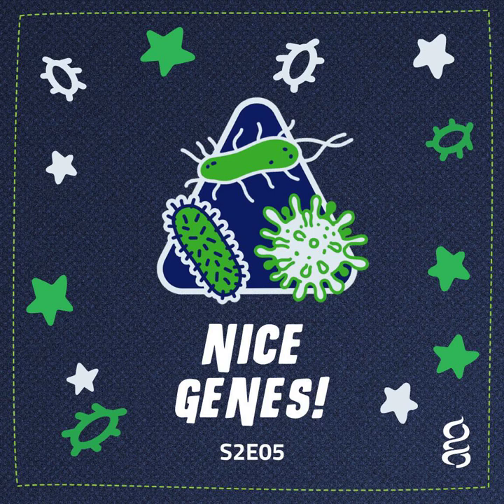So what we're looking for is there's a special gene inside of it. They find that special gene. So we're going to amplify this gene, and that's what we're going to sequence. And now they can pull all sorts of information from it. We kind of don't really know what's in there, and we know there's a lot of different species in it. It's a bit like popping the lid off of a treasure chest, where genomics are the jewels.